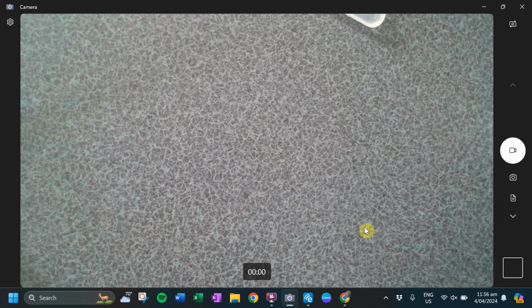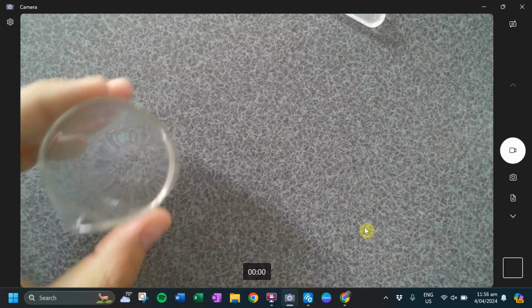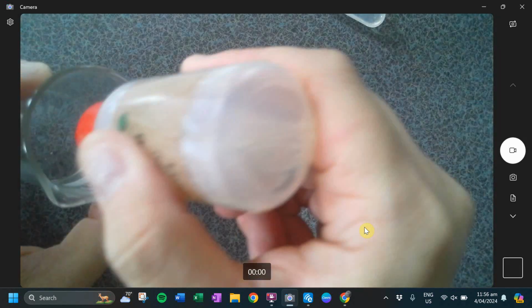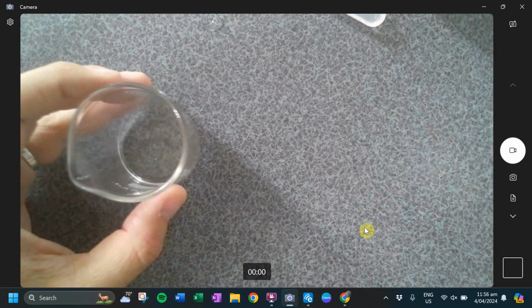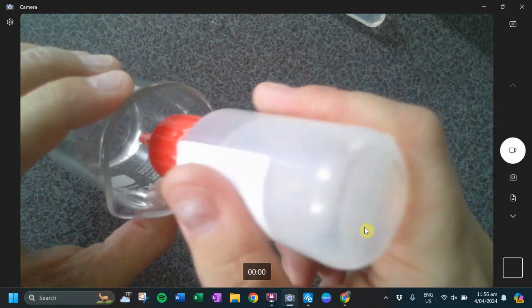All right. Something to keep in mind is I am happy to give you guys other chemicals if you want to use them to compare and contrast. So if you think, I don't see a precipitate, but I want to be sure that it's not sulfate, I'm happy to grab you a sulfate so you can double check. So let's say you take sulfuric acid and then test it with the barium nitrate.